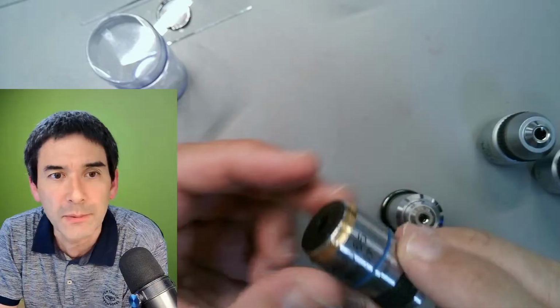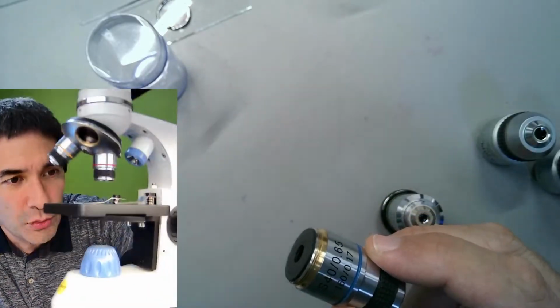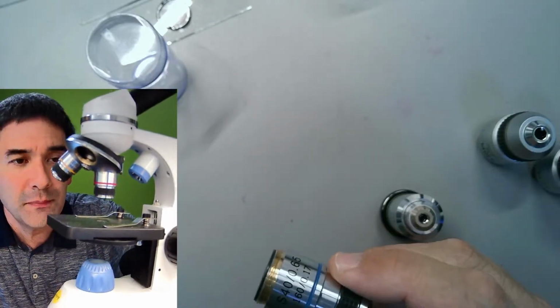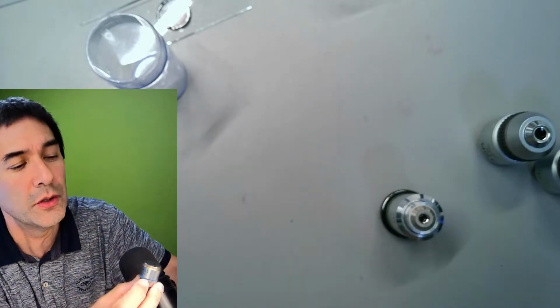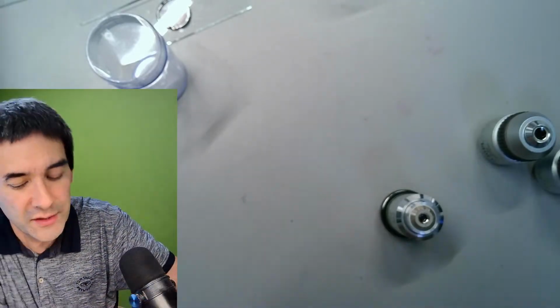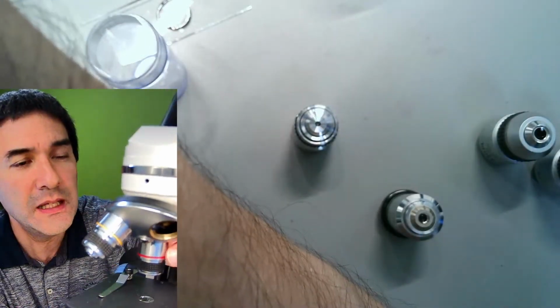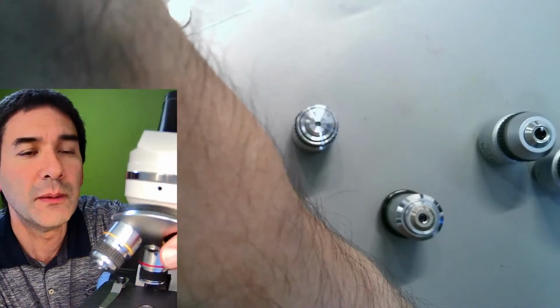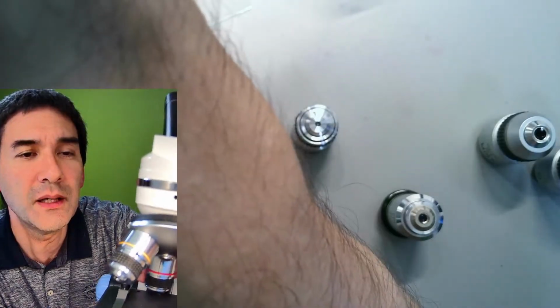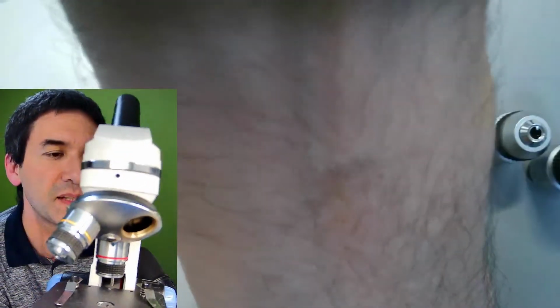Now, to make the issues a little bit more complicated, isn't this beautiful? It's yet more complicated. This introductory microscope here, I said, is a little bit better than some of the others because it has those larger 160 millimeter objectives. There are also cheaper versions of such microscopes around that have even smaller objectives, and they're not even compatible. So it's kind of interesting, the different standards that there are. Those objectives here I've also seen give slightly better contrast.